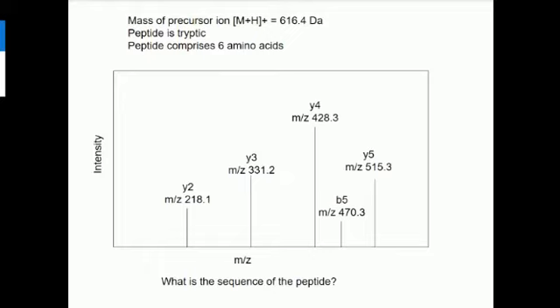Okay, but we still don't know what this one is. So what I would do is take the Y2, which we know has the unknown amino acid, lysine, the C-terminus and the N-terminus, and the charge. Okay, so we want, is it 218? So that's Y2.